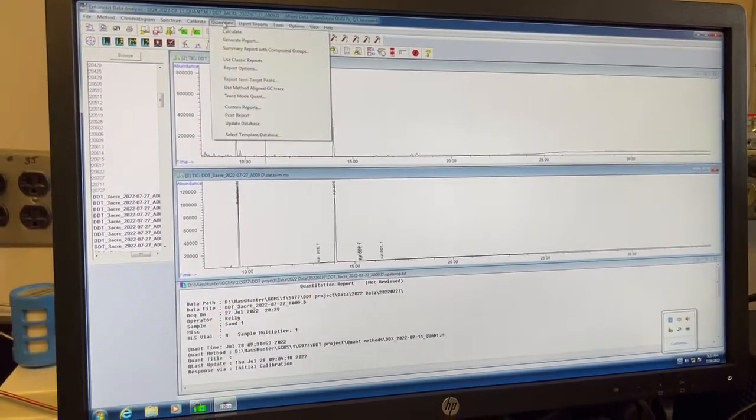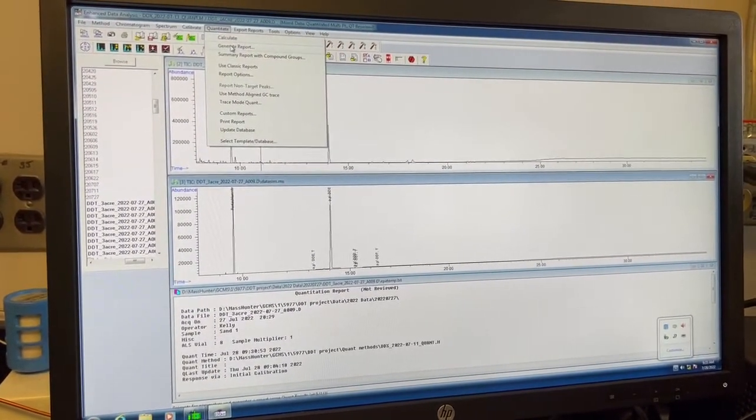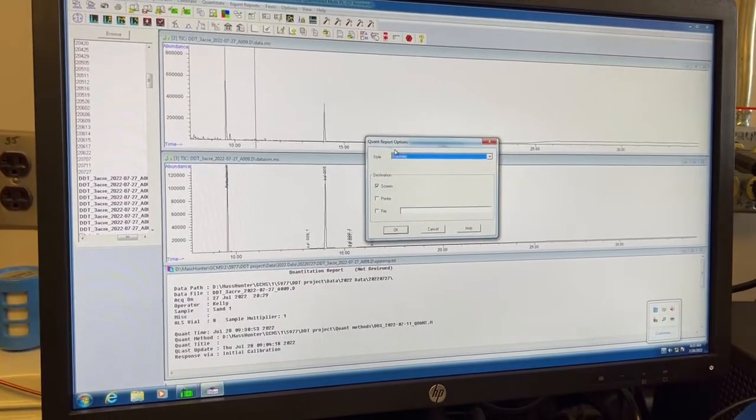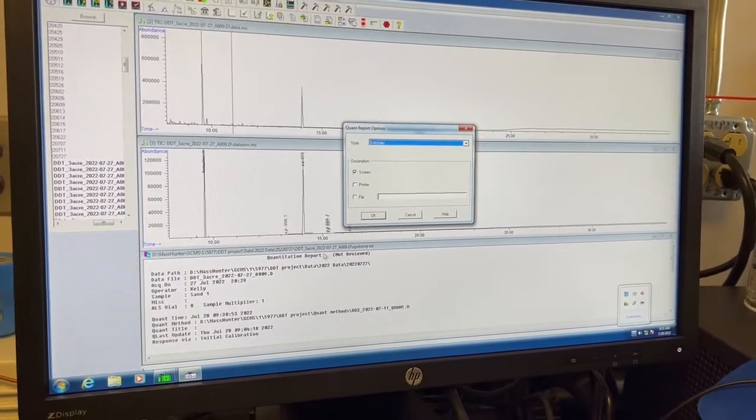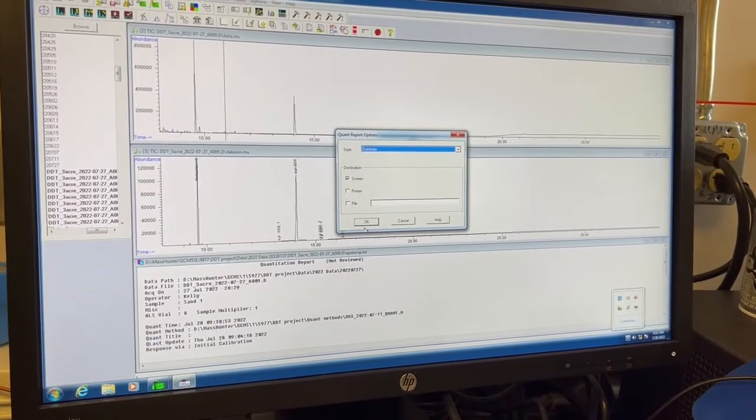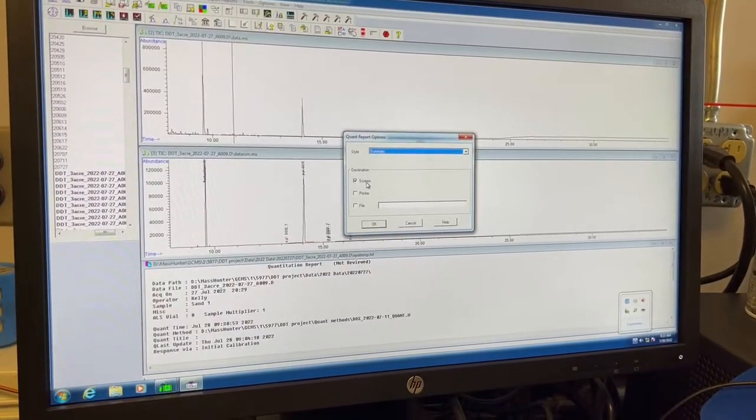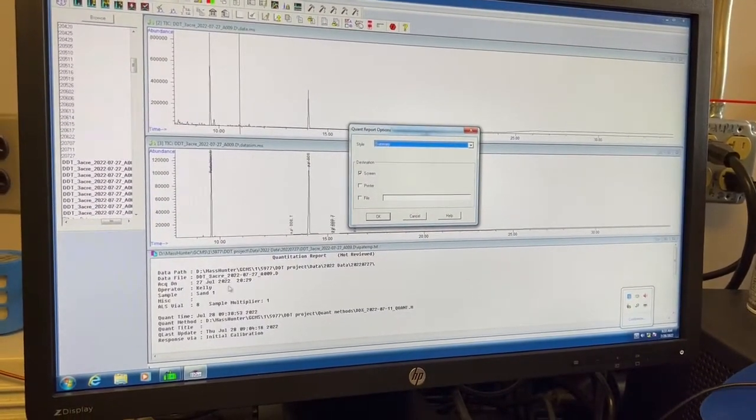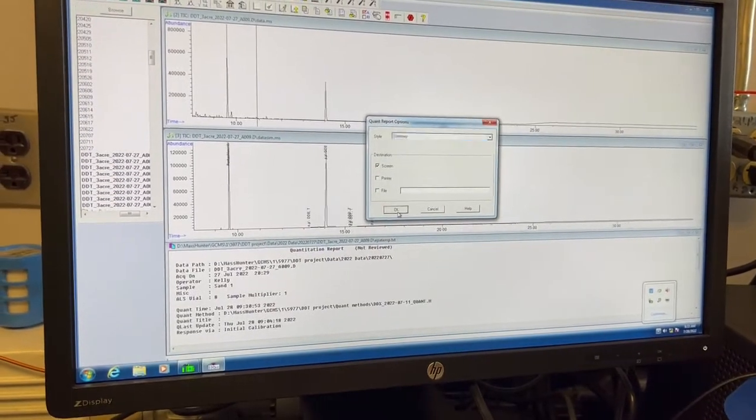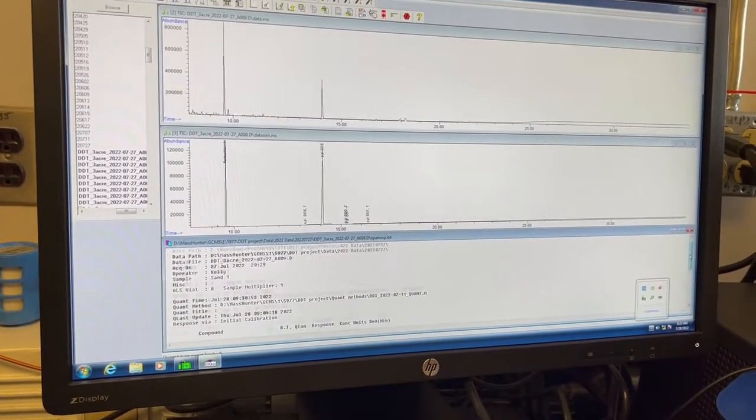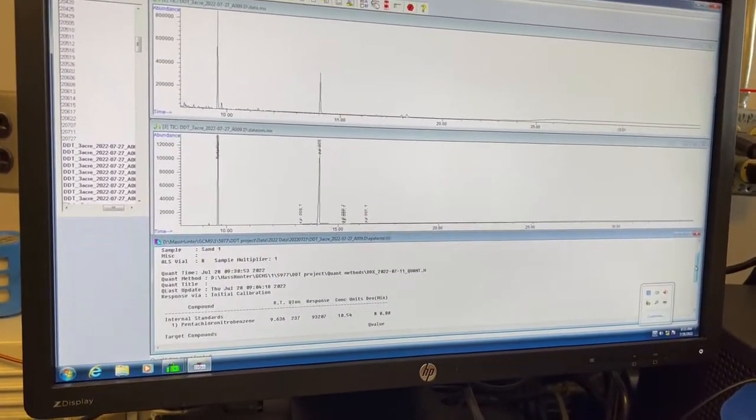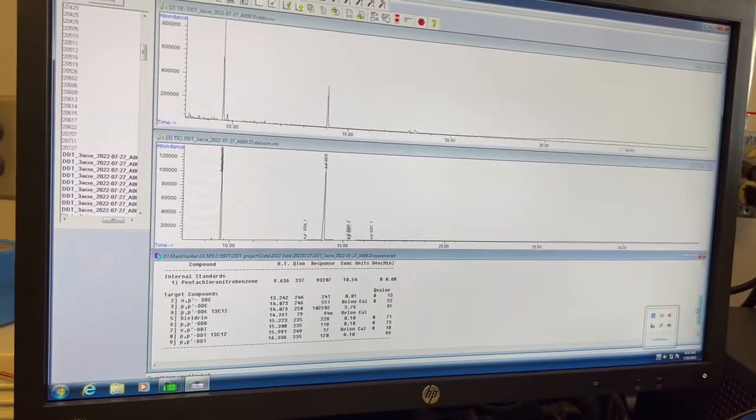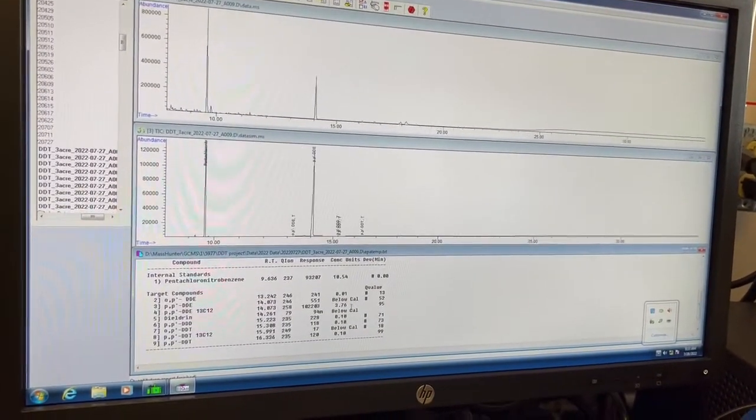And if we want to see our results, we can go to Quantitate, Generate Report. And this will basically just print out the results down here. That's why our destination is a screen. So it's just going to come up on the screen and give us a summary of what we just found. So it's going to use our calibration that we just did and give us results.